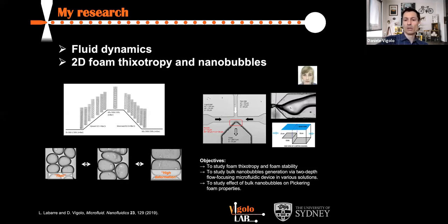And this is really an interesting phenomenon. As I was mentioning before, obviously, microfluidics gives you the chance to apply fluid dynamics principles, but also material science principles, to a much smaller scale. And this is a very versatile platform. And so I started to move my interest towards biology and biomedical applications.